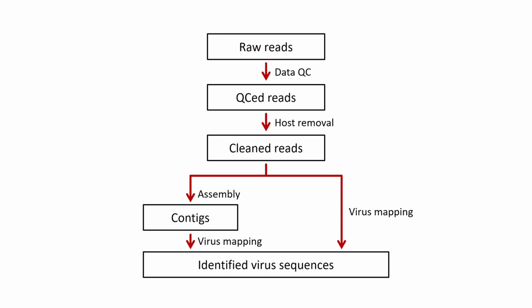Imagine we have a tissue sample from a sick pig. For some reason, we suspect a virus infection, and we are planning to use NGS to identify the virus in that tissue sample. We have extracted DNA and RNA from the tissue and then performed Illumina NGS.